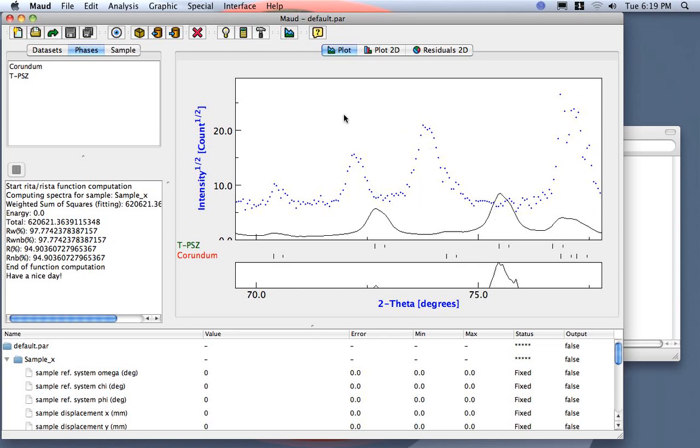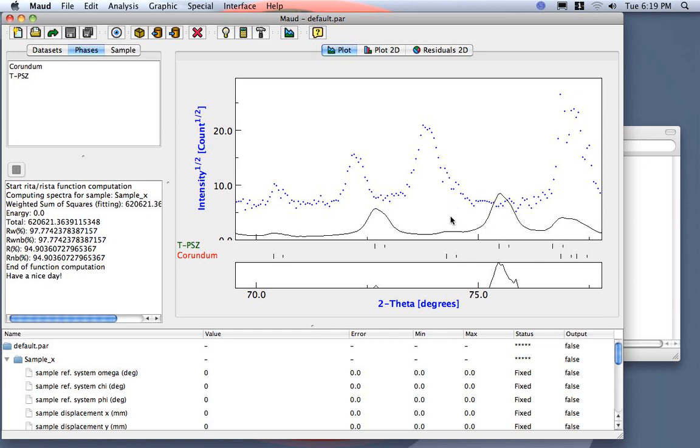So the good thing of using this part in this case is just that this peak here, the 0-0-4, it only depends from the c-axis and instead this peak here, 2-2-0, depends only on the a-axis. So it's more easy to adjust the cell parameter for the tetragonal zirconia using one and just see the result only on moving one peak.